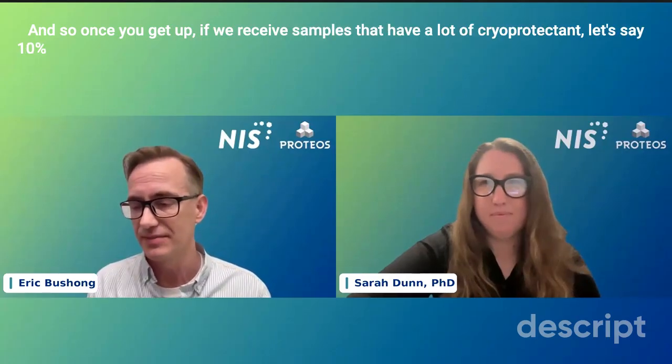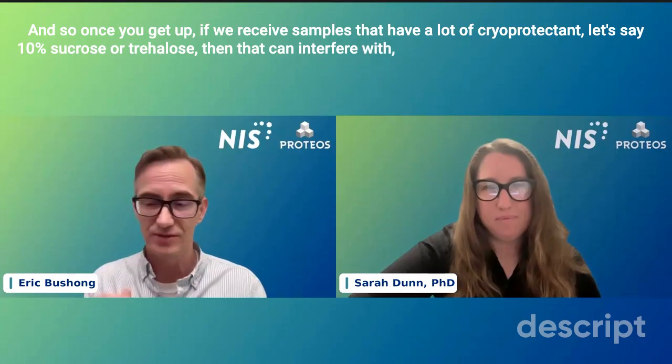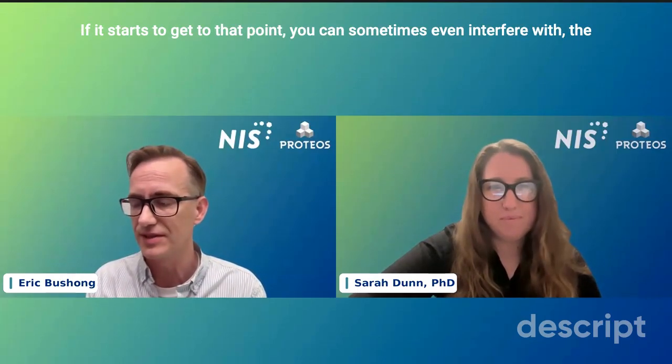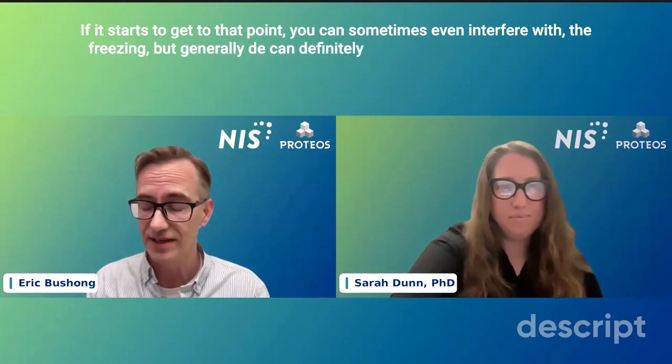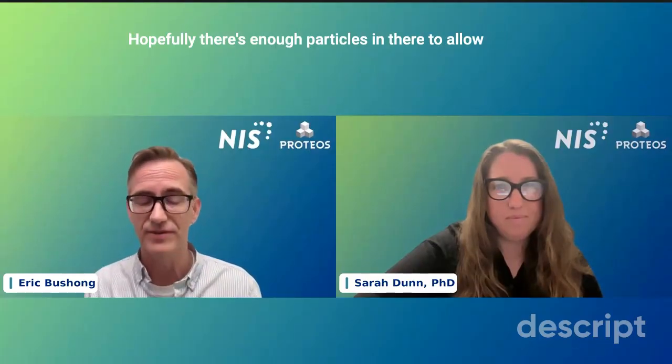The sample prep, sucrose is a problem. Any cryoprotectants can reduce the contrast. If we receive samples that have a lot of cryoprotectant, let's say 10% sucrose or trehalose, then that can interfere with, first of all, just getting good freezing. If it gets to that point, you can sometimes even interfere with the freezing. But generally, it can definitely interfere with the contrast. And so sometimes we'll dilute samples to reduce the presence of cryoprotectants. Hopefully, there's enough particles in there to allow for that.